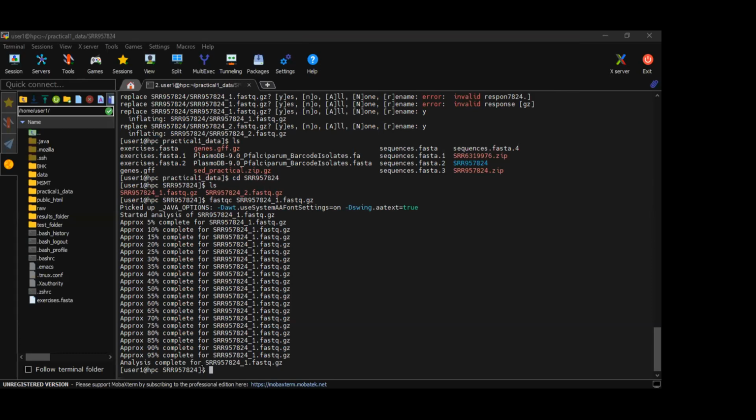Anyone else stuck? Maybe only have to copy it to my local computer. Yeah, okay, you can share your screen again. I'll sort of walk you through it. It might help others as well. So let me try and do that. That's you, are you sharing your screen again? Yes. Okay, perfect. Thank you. I can see it now.